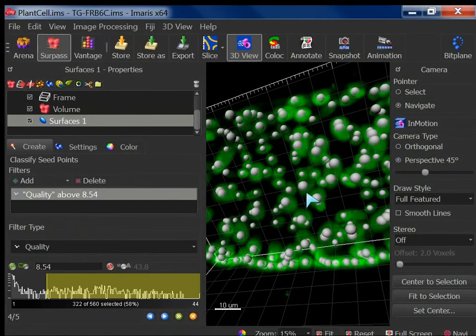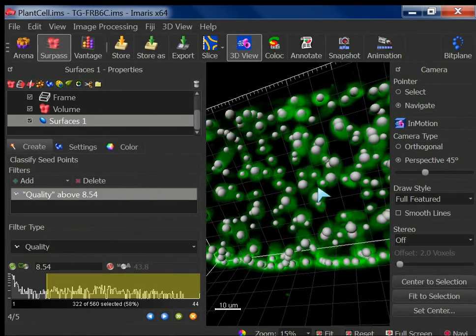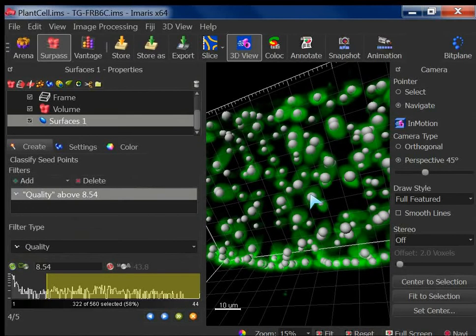Now I can see these 2 points. Then if you do this, you don't get the information about the shape and sides, the true size of the shape? Yeah. Okay. So what we are doing now is just creating a seed point for watershed.